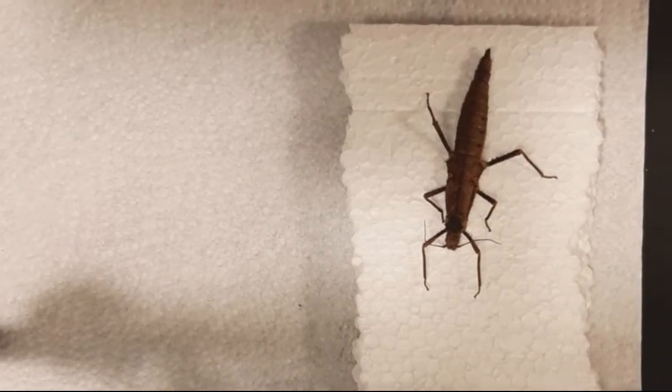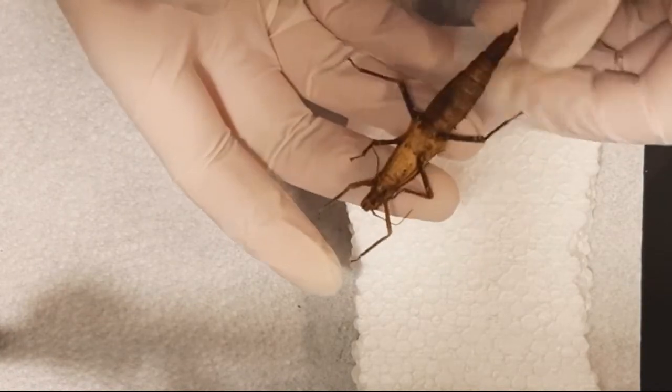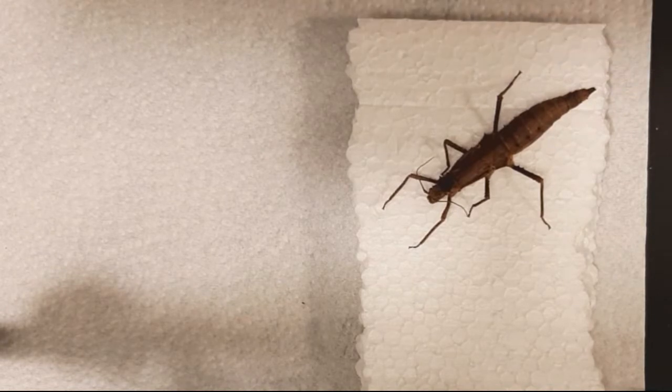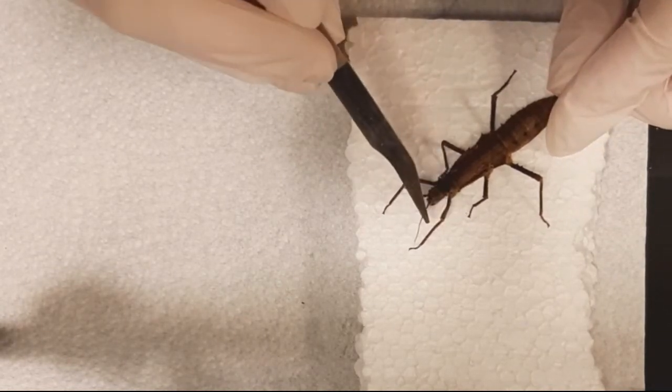Hello and welcome to a new video. In this video I will mount a Tisamienus species. It's a stick insect, a smaller species of stick insect. This one was bred in captivity and died a natural death — just old age.